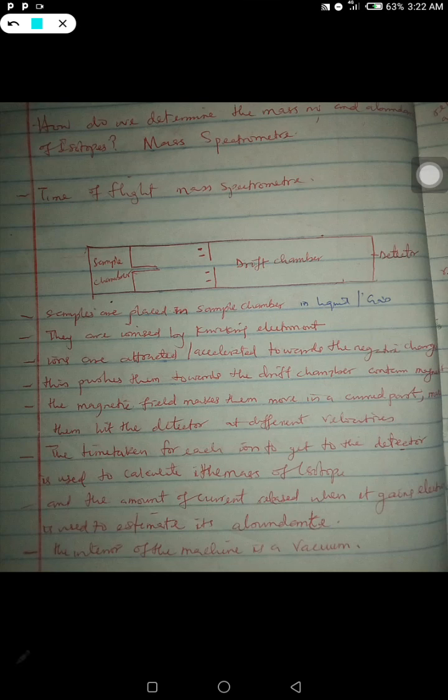They will be equally attracted towards this region. That attraction is what we call acceleration. So the ions are attracted, or accelerated, towards the negative charges, because the ions are positive. Now this pushes them towards the drift chamber. This region is the drift chamber.